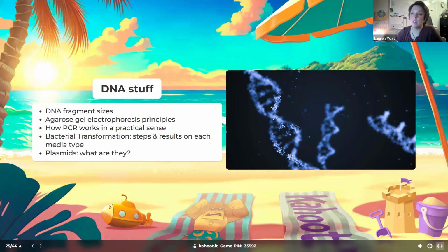Right. Okay. So that's, and then the elongation step. We already went over that. Yes. Okay. So that's the gist of how PCR works. It just adds on nucleotides and keeps doing it until you stop it. Like if that runs at 72 degrees Celsius, once you heat it back up again to 92 degrees, you're separating the strands again. You stop elongating. There's no real termination step. You just keep going for, say, 5 minutes and then you separate it again. So there's no real termination step in PCR. You just keep doing it over and over and over again.